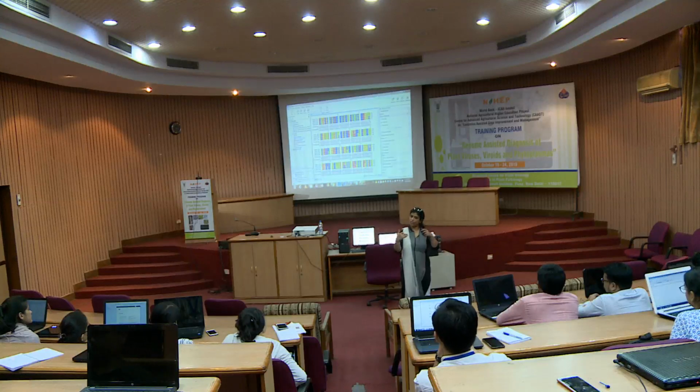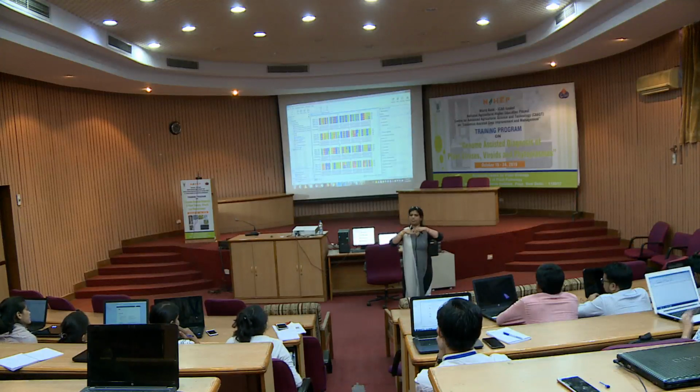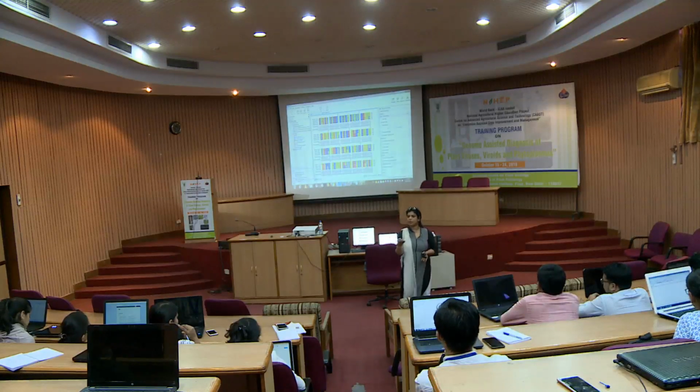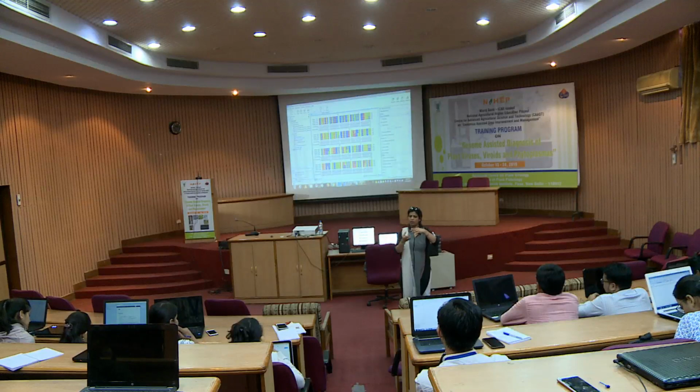A contig is where you are joining the regions considering that overlapping region. Consensus is similar among all. Okay, now this is the region, right? My fingers are the consensus, but the whole sequence is the contig. From here to here it is the contig, and this is the consensus. Consensus is the conserved region among all, but a contig is where you join two sequences, considering that overlapping region as a single one. Either you will consider this, or cumulatively it will form as one.